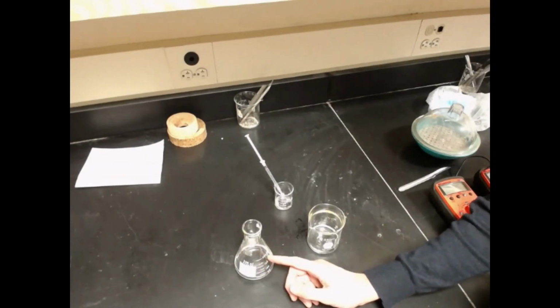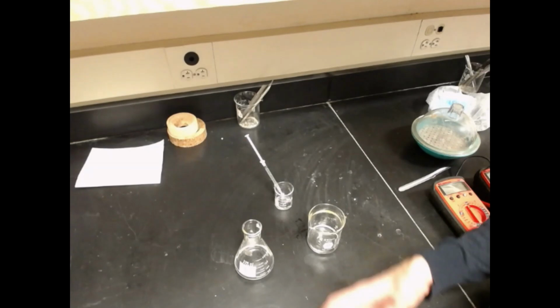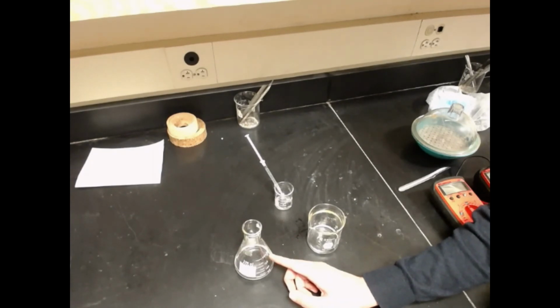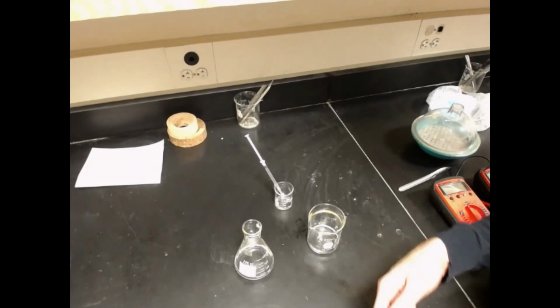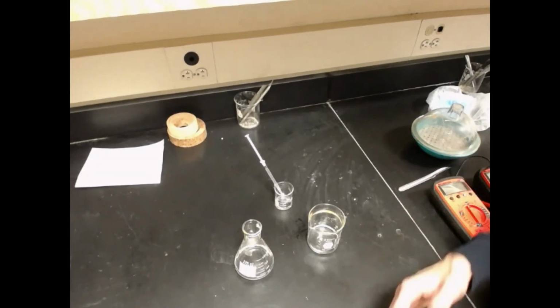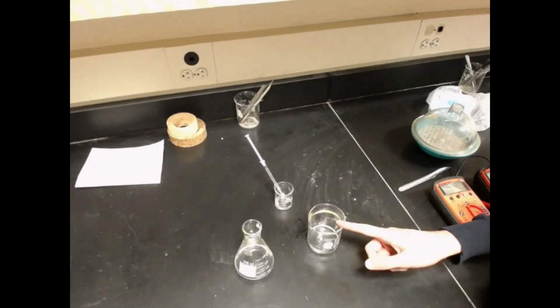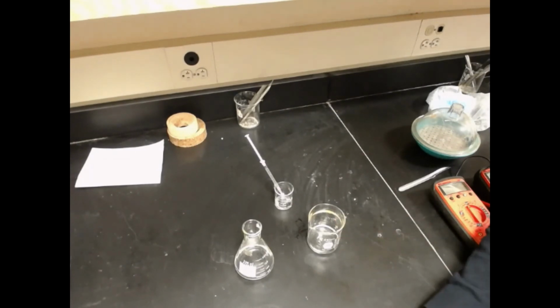And then there's a small amount of starch as well, and the starch is present to complex with the iodine so that we can see the color when all the thiosulfate is used up. There's also 1 milliliter of the 0.4 molar thiosulfate in here, and that's what's going to get consumed. That's our clock reaction: when the thiosulfate is gone, we'll know the reaction is done because it will change color. In this solution, this is just the peroxydisulfate, or S2O8 2-, reactant as well.